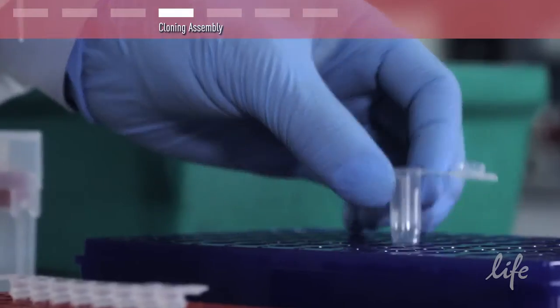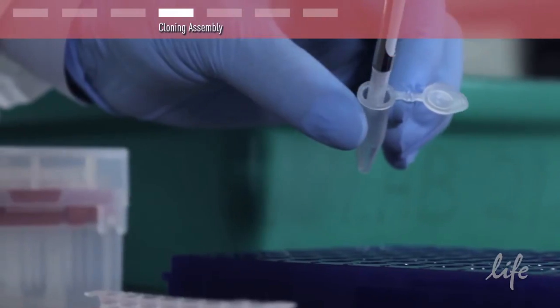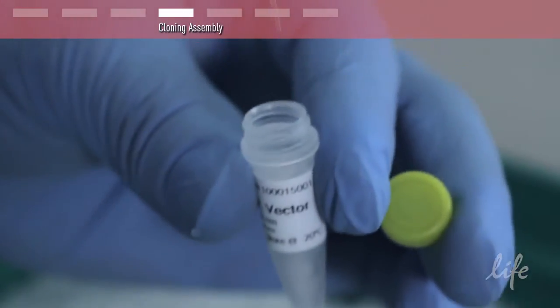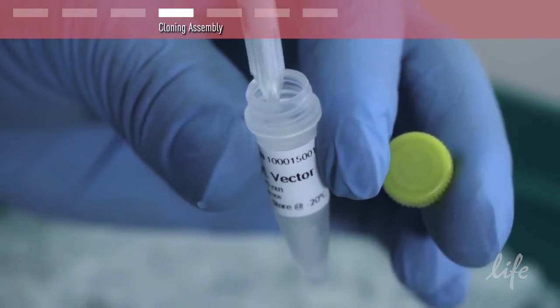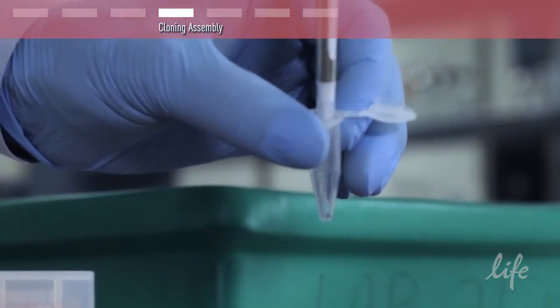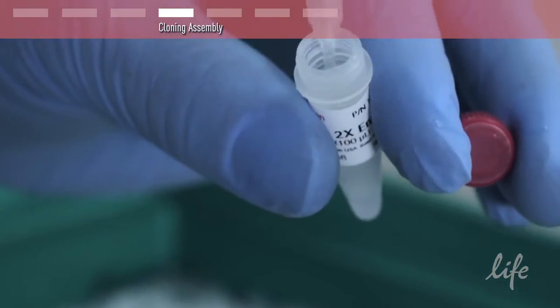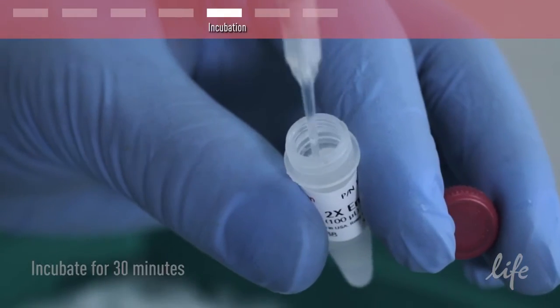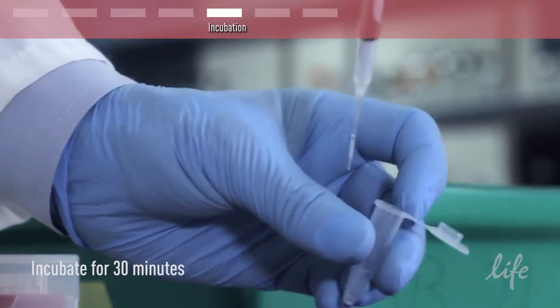Next add your PCR amplified fragments and linear vector to the tube. Now add the assembly enzyme and incubate at room temperature for 30 minutes.